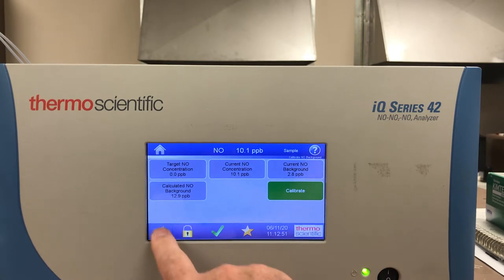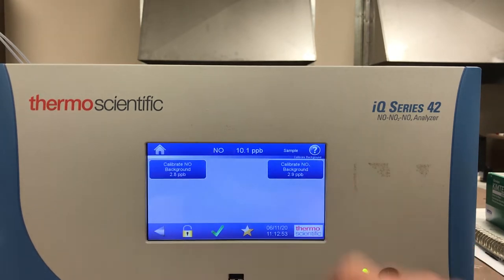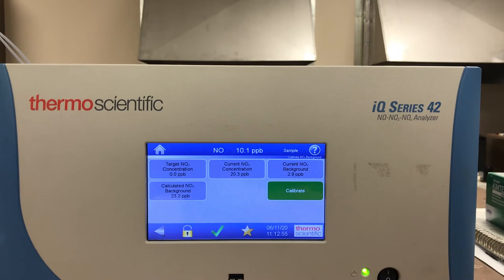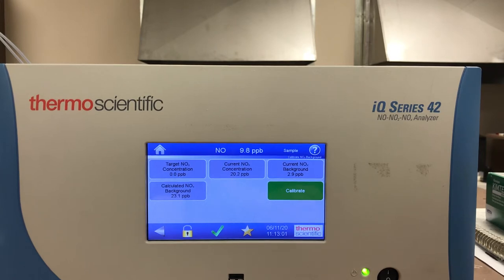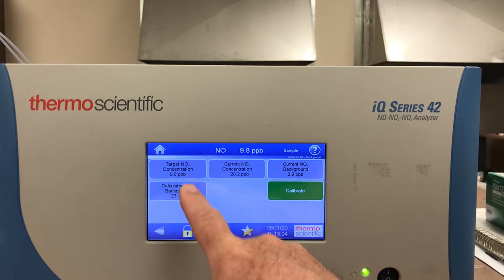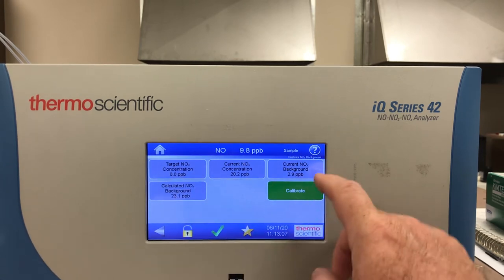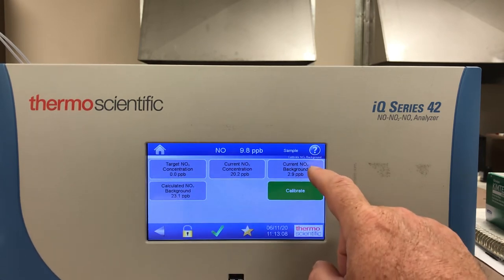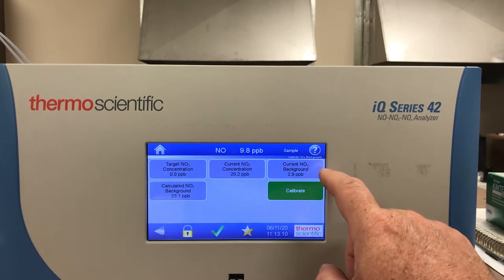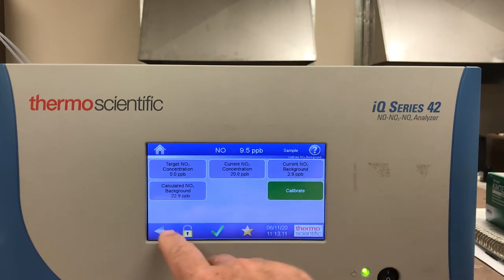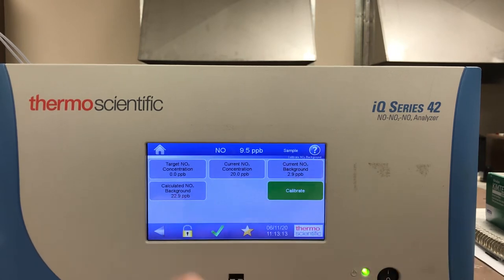If I'm sampling zero air I just press the green calibrate button and it will adjust my NOX background. It even gives you the target concentration of zero, the current NO background, and the calculated background if I was to do the adjustment.